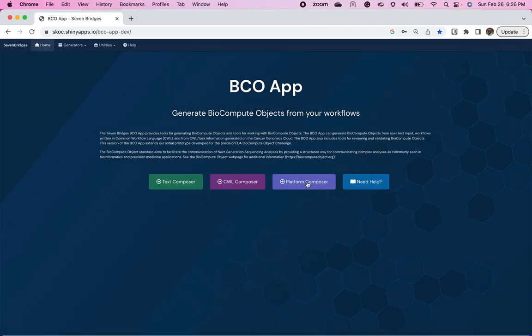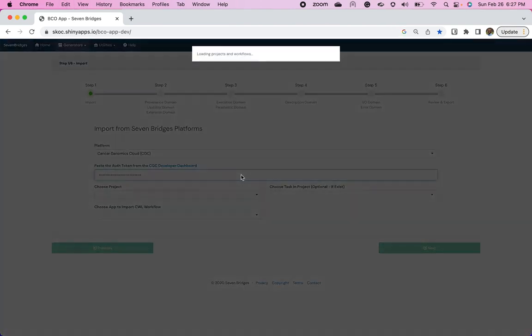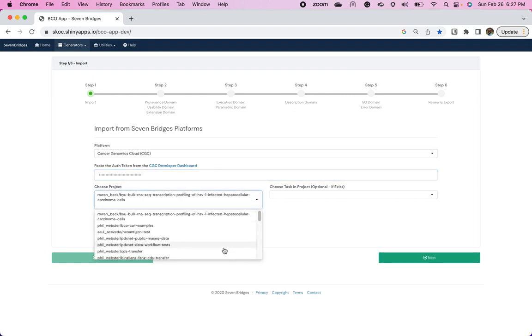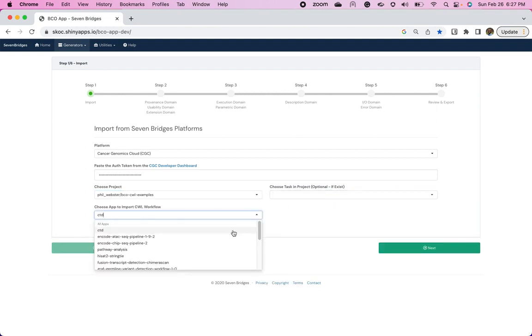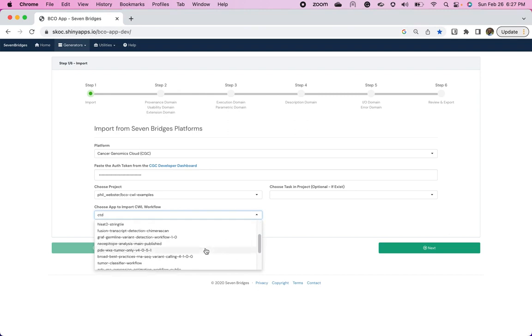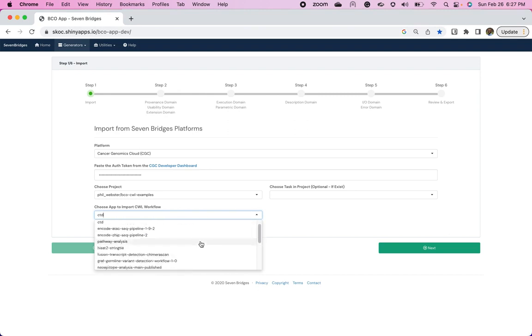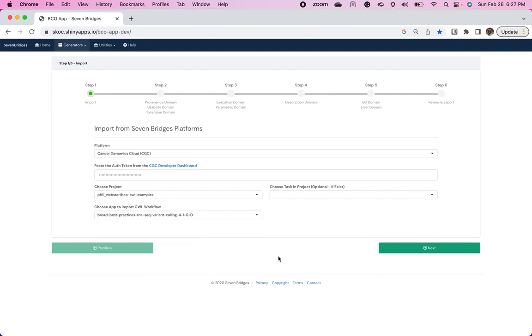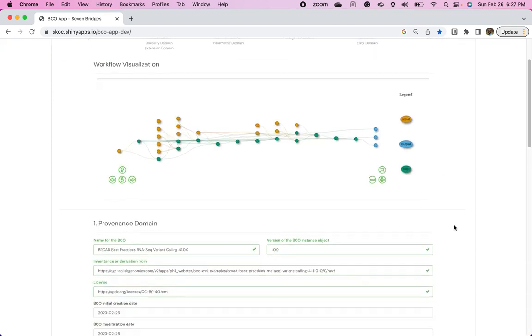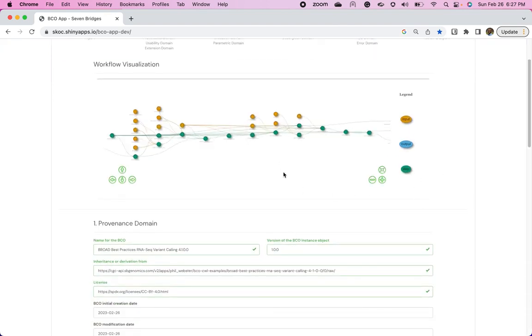And so if someone working on the CGC wants to upload a workflow, they can paste their authentication token from the CGC. They can select a project that they work on. I'm going to choose the BCO-CWL examples. And here's all the workflows I've used. I'm actually going to pick another one here. We're going to go with Broad's Best Practice for RNA-Seq Variant Calling, since I feel like I mentioned that earlier, variant calling earlier. And this is a publicly available app. You can find it on the CGC.